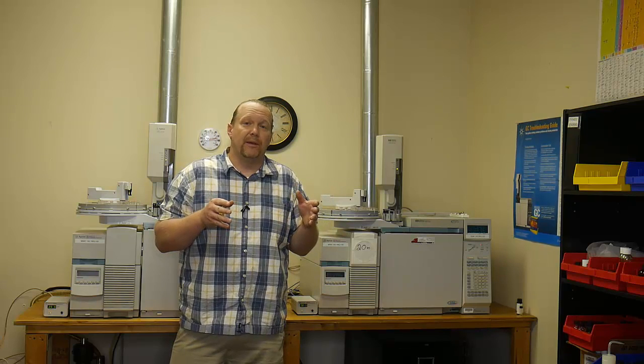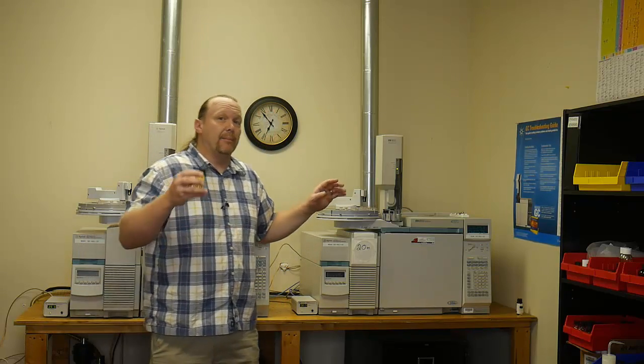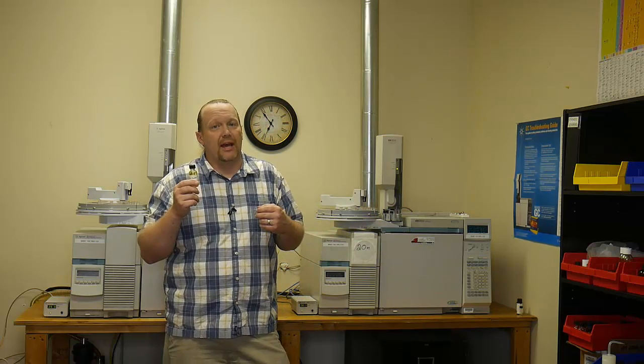Once your experiment is compounded by one of the lab techs, we smell it and see how close they are. If we don't think it's good enough, we'll shoot it on this machine again. And the combination of what the lab tech made in the first experiment compared to what the readout is, we can actually narrow it down to an X2. So that's a second experiment. The second experiment is usually 99.9% accurate. So when we're sending out duplications and we're sending you a product, we're pretty confident that it's going to be exactly what you sent us.